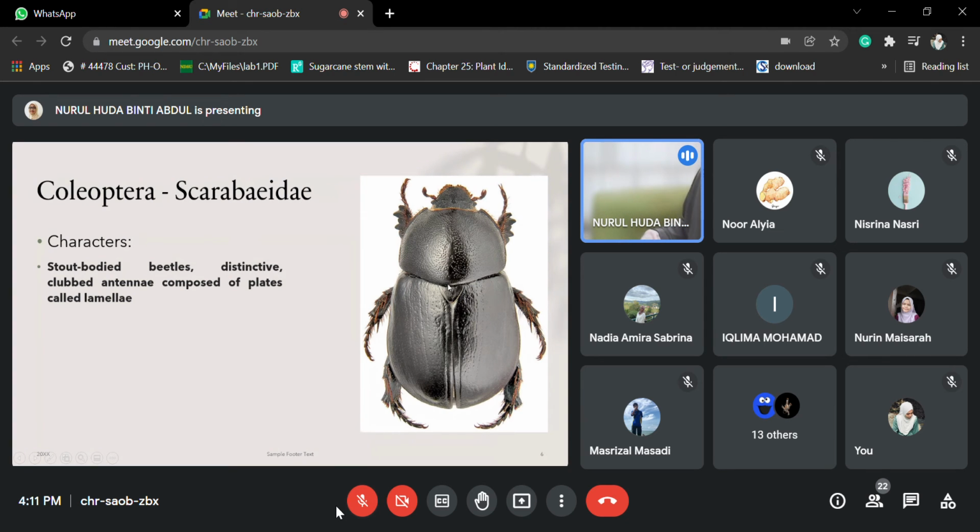But there is what we call a scutellum, this part.